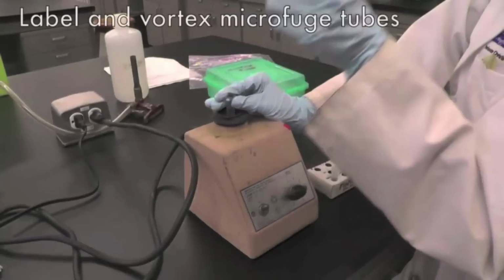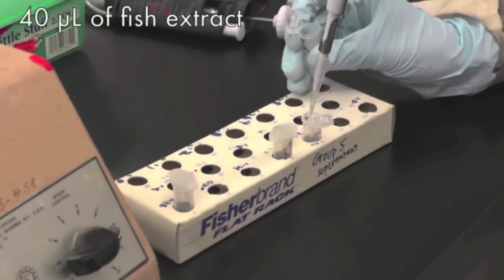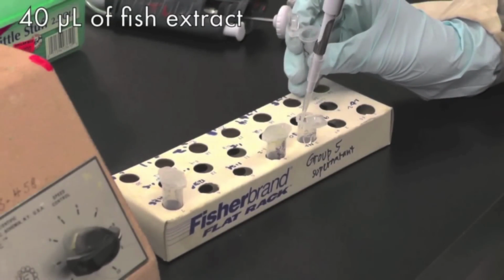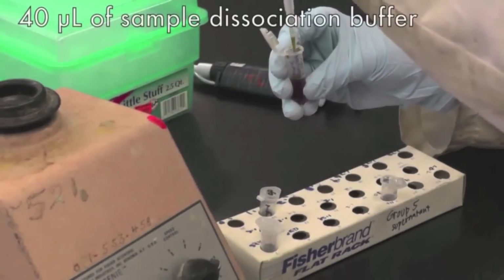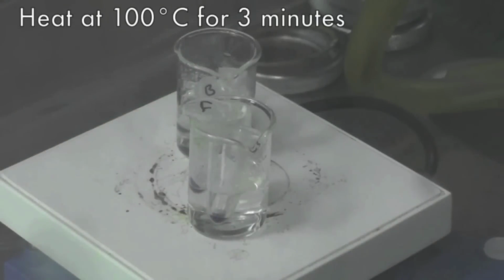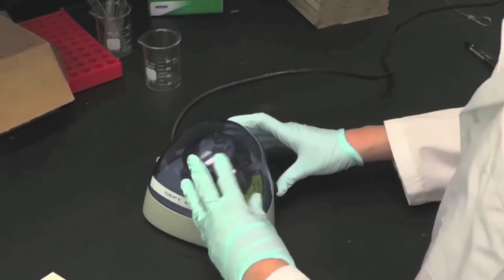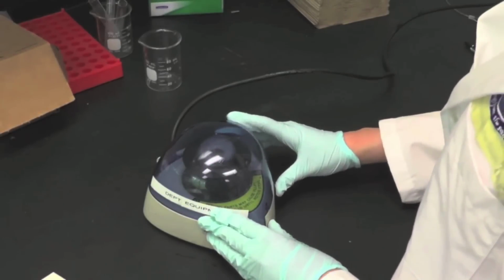To prepare samples for SDS-PAGE, label the microfuge tubes corresponding to your samples. Pipette 40μL of the fish extract into the microfuge tube and add 40μL of sample buffer. Heat the tubes at 100 degrees Celsius for 3 minutes, then pulse centrifuge for 5 seconds.